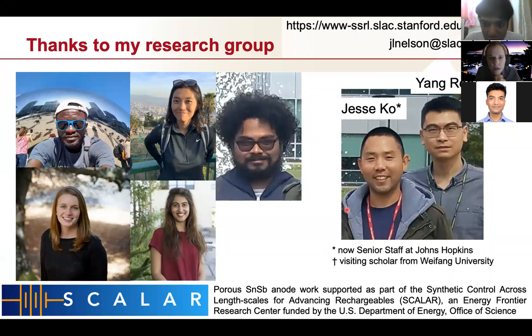Got it. So Rajesh has another question. Rajesh, you can unmute yourself and go ahead if you can. Can we use electrochemical X-ray to observe lithium plating and stripping mechanisms on lithium electrodes in symmetric cells to understand the volume expansion and contraction issues during formation and deformation of SEI on lithium? So detecting lithium with X-rays is tricky. It's the lightest metal.